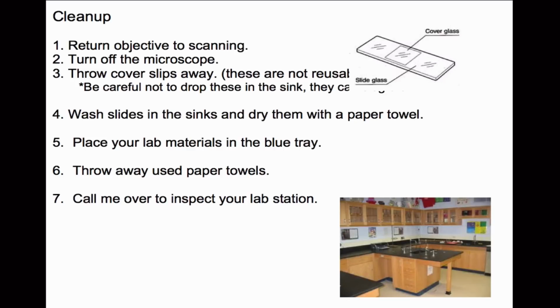For your slides that you have, you're going to throw the cover slips away. Those are not reusable, but the slides are reusable. So don't throw the slides away, just throw the little cover glass slip away. Don't put it in the sink because they'll clog up the drain. You have to actually put it in the trash can.